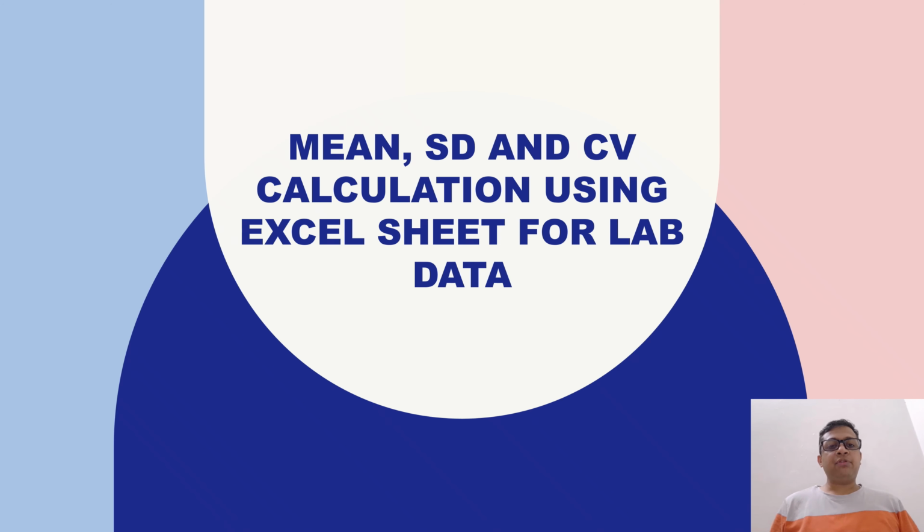As you all know, we have two aspects in lab quality. One is accuracy and the other one is precision. Mean, SD and CV are used to calculate the imprecision in the laboratory.